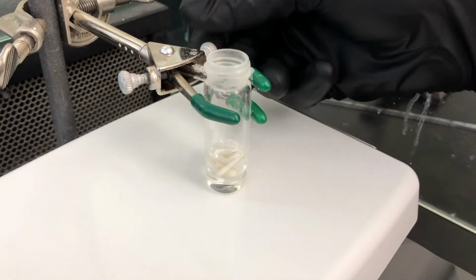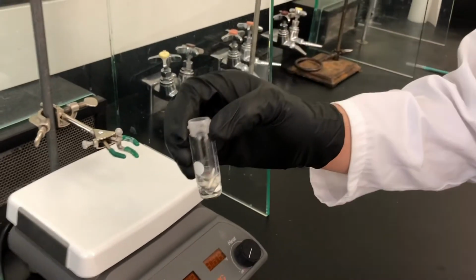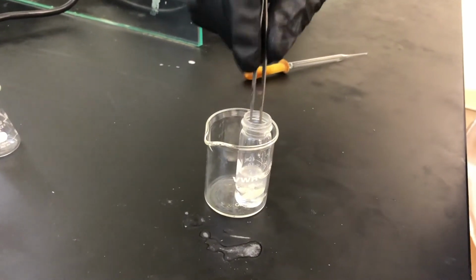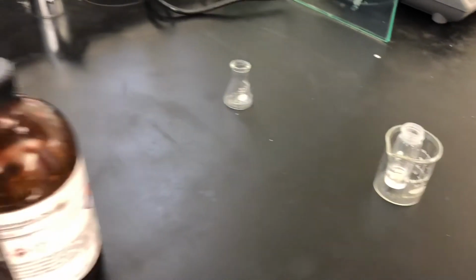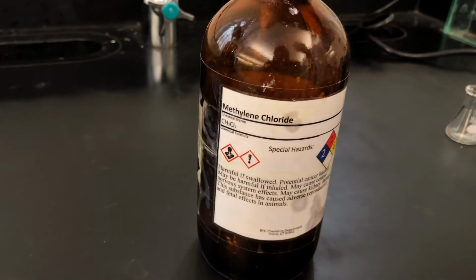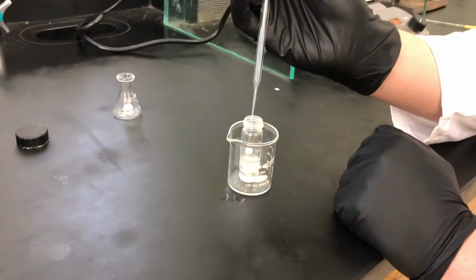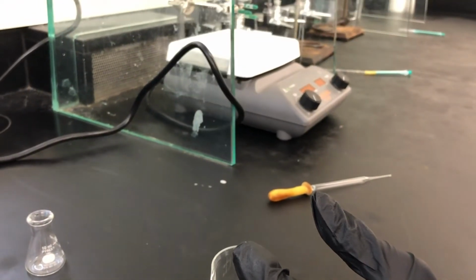Okay, now we're going to use methylene chloride, our favorite solvent, to separate the cyclohexanol from the water layer. I'm going to put in a little beaker here so it doesn't tip on me. I'm going to take the spin vane out so it doesn't interfere. Here's our methylene chloride. Okay, I'm just going to put a couple milliliters in the conical vial. Get the phases to mix.